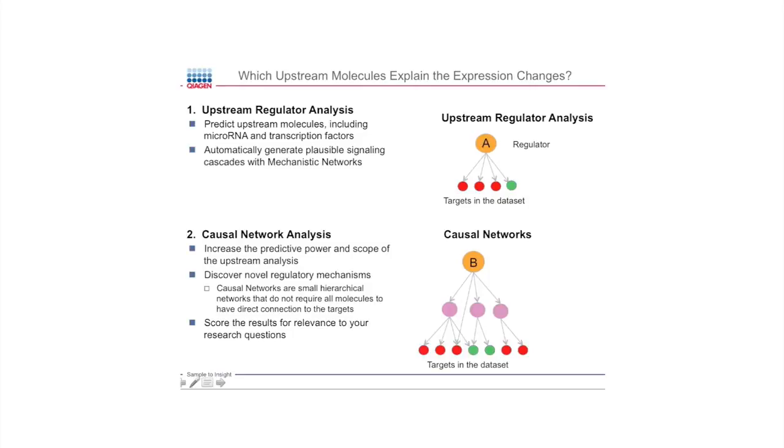And so it's very predictive and could find completely novel regulators because, again, like in this little mock-up here, there's one paper, let's say, that talks about B affecting the expression of this one, but there's no other papers that talk about how B might affect this one. It works through a regulator. So you're finding novelty there.